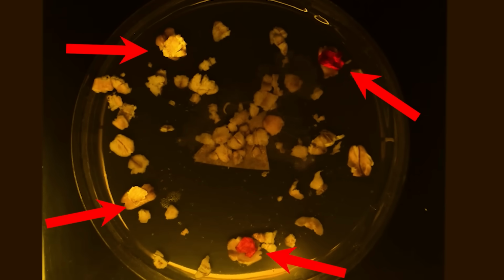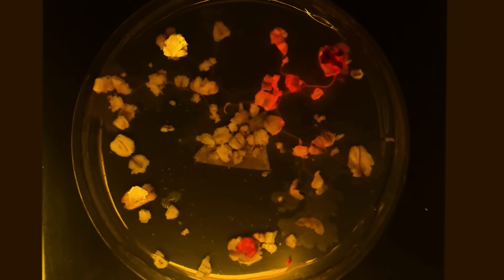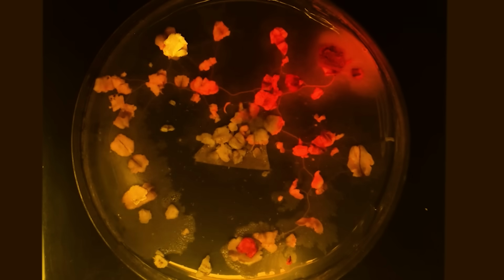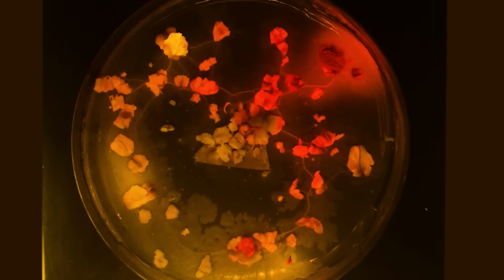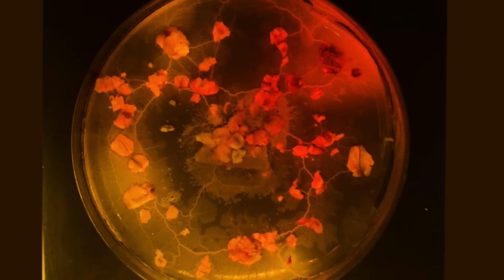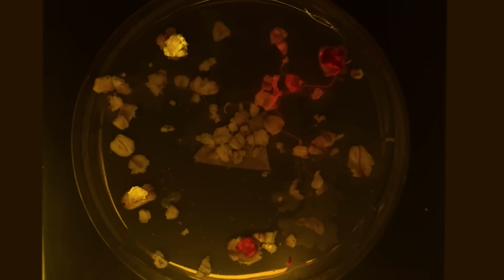The dyes we chose glow under UV, so with an orange filter on the camera to remove the purple light, we can see the dyes glowing brightly. This way, we'll see the exact moment the nutrients start being uptaken, as the glow allows us to see far lower concentrations of dye. To my delight, this worked even better than expected, and you can actually see just how far and fast Jerry moves the dye once it starts being consumed. Eventually, the entire plate is a glowing network of tubes, and the oats are nothing but glowing husks.